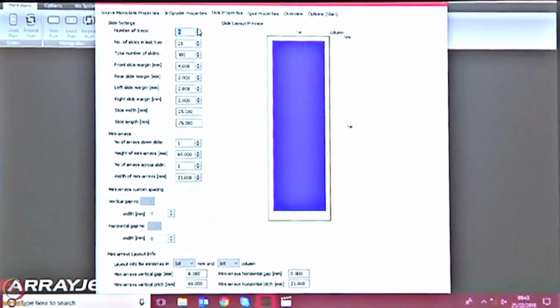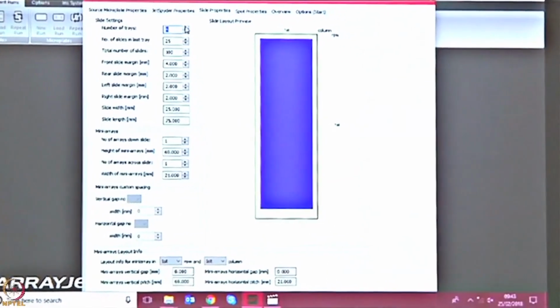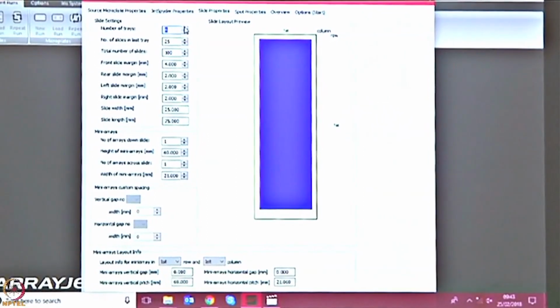Now, somebody give me a normal number. How many pads? Or let's take an ELISA. Let's take 96. I'm going to take it to making. So what I'm going to do is divide this full slide into 96 squares with the software.